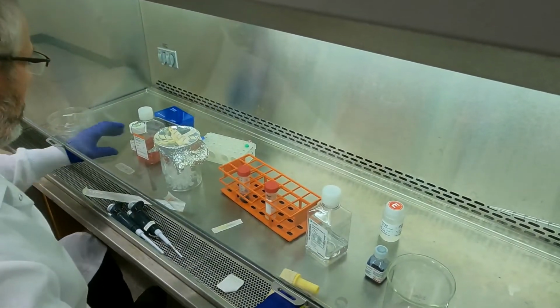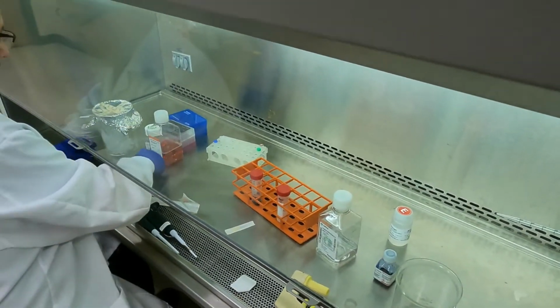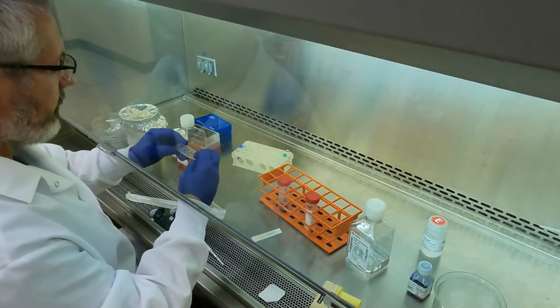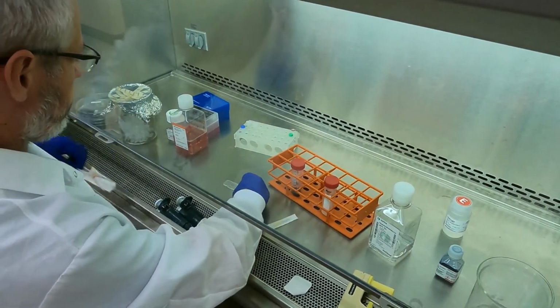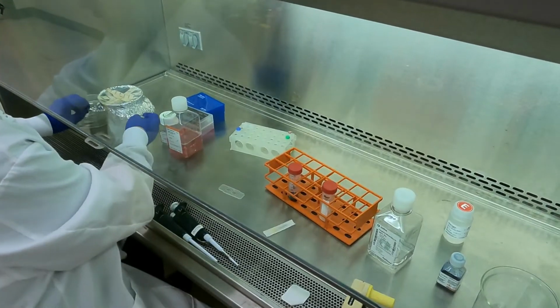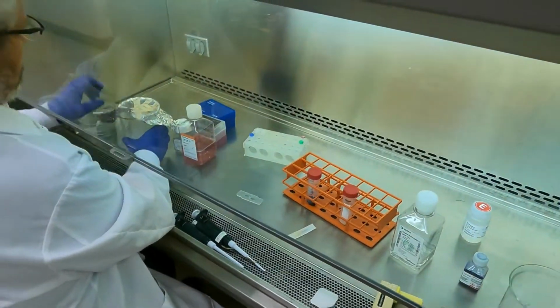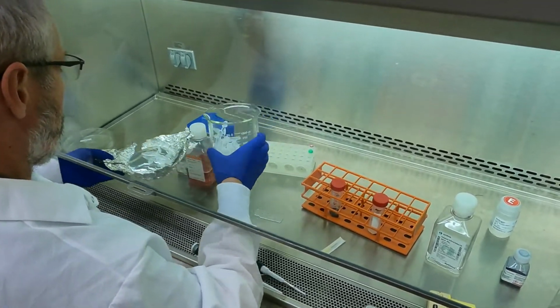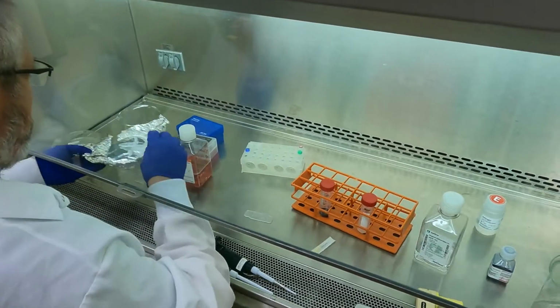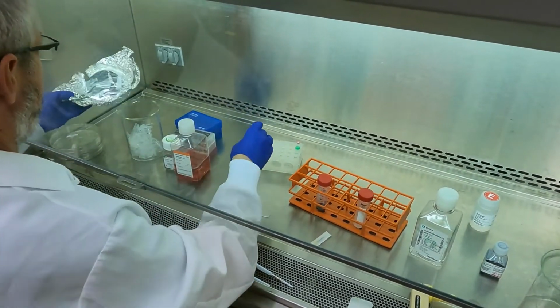Right, so we have a machine that can count cells, and it uses a plastic hemocytometer like this. And what we need is a tube. This bit doesn't really have to be sterile.